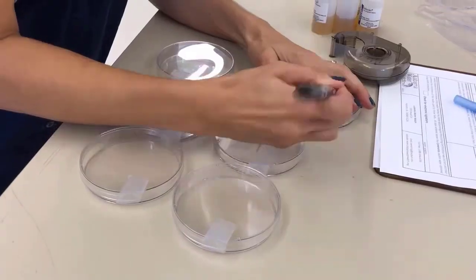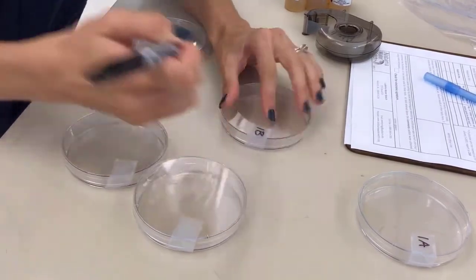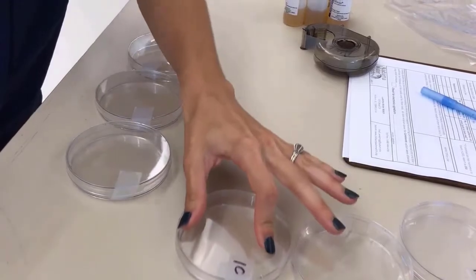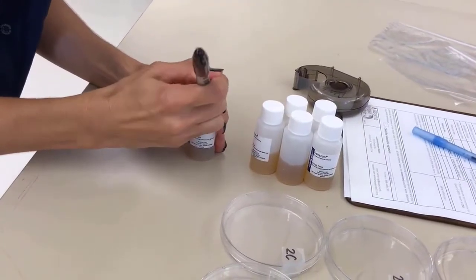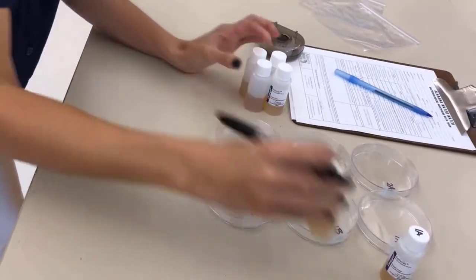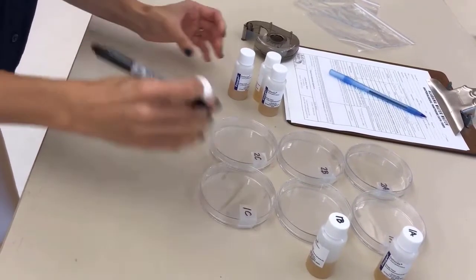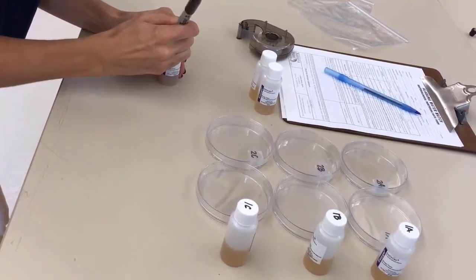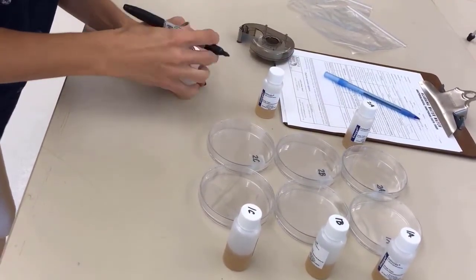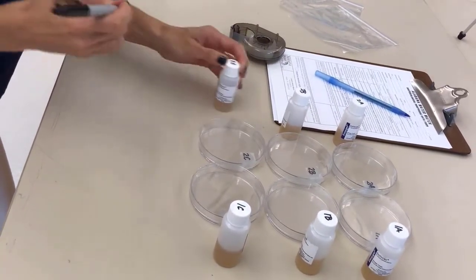Use a permanent marker to label each of the Petri dish lids and the corresponding media bottles with numbers or letters that indicate the site and replicate. For example, if you are sampling 2 sites, label the plates and bottles for the first site as 1A, 1B, and 1C. Label the plates and bottles for the second site as 2A, 2B, and 2C. It is best to write on the tape rather than directly on the Petri dish. Set your plates aside for use after you have conducted your sampling in the field.